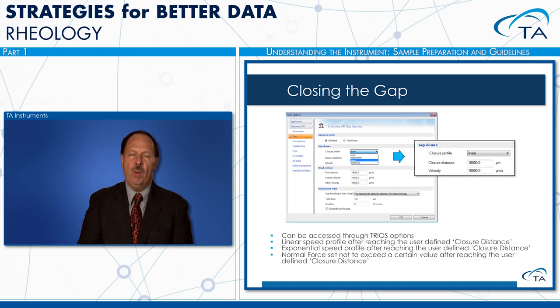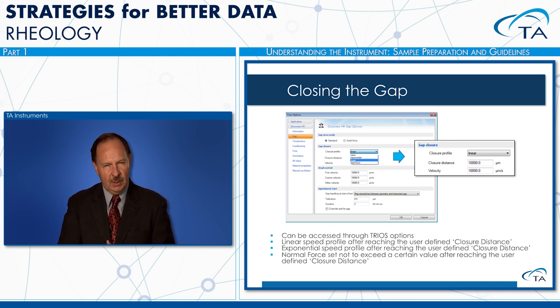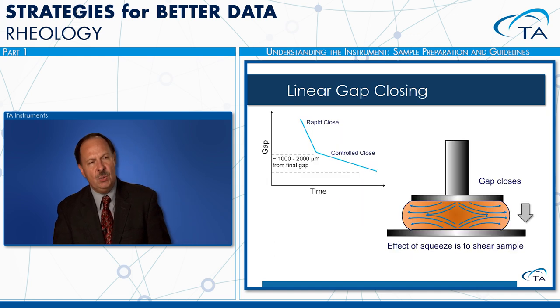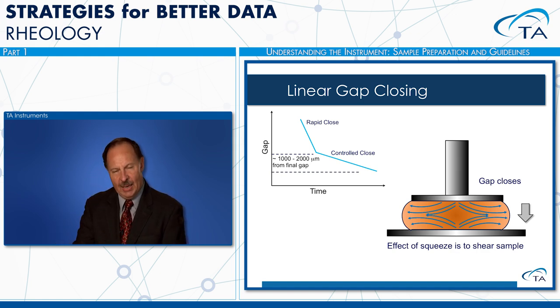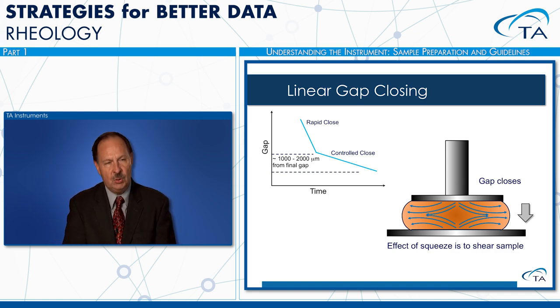Okay, so we mentioned that we would like to give consideration to the way that we close the gap, and we would like to do this in some cases as gently as possible. So if we go into the options and we go into the gap, you'll see that there are some different ways that we can control the way the head goes down to go to the target gap. So we have linear, exponential. You could use force to do that.